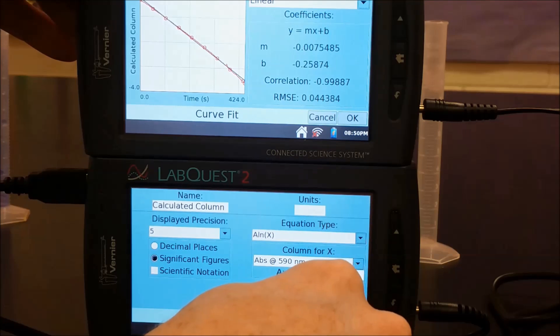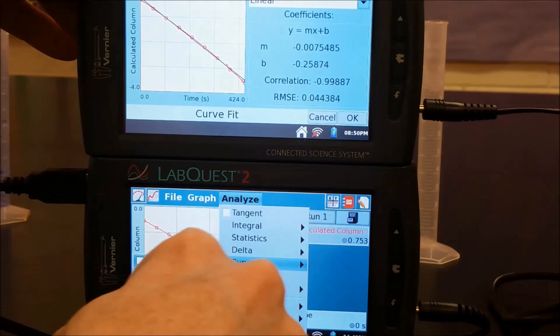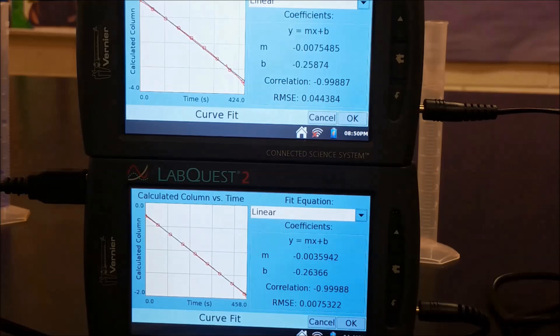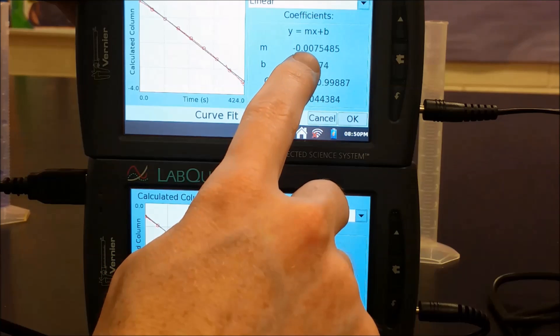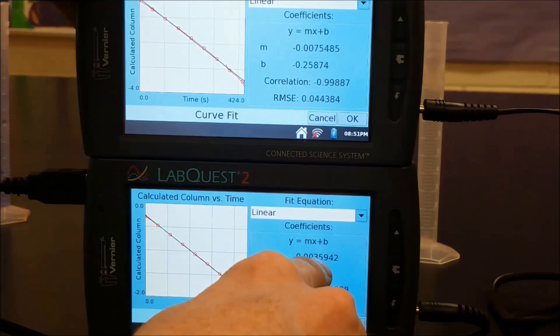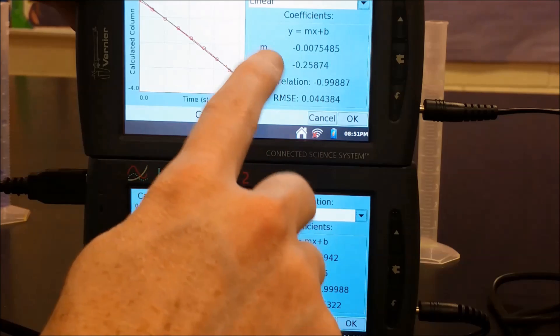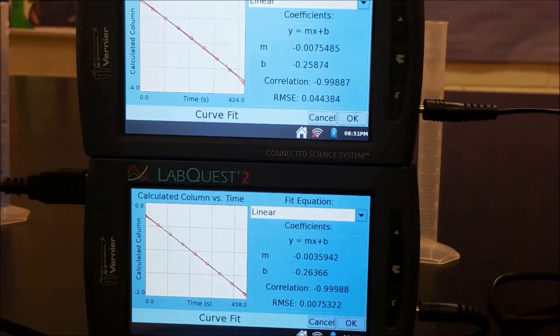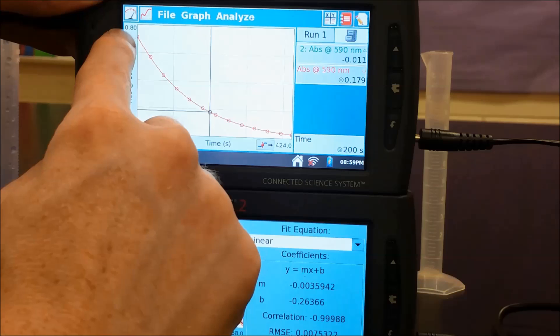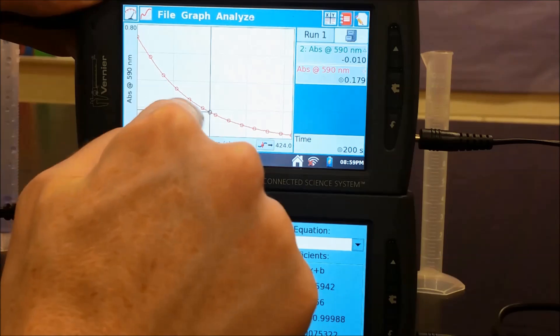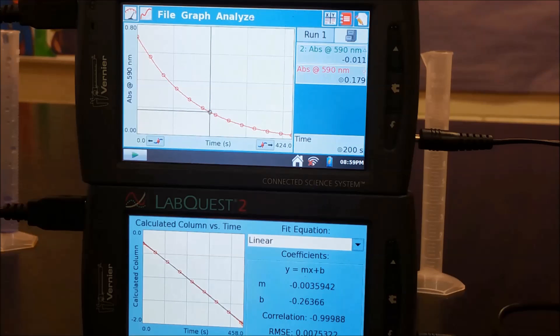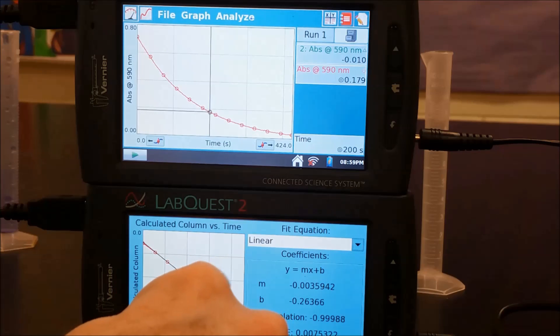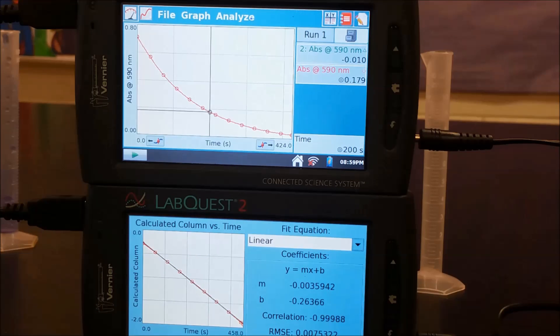So under natural log there. And we end up with a similar thing, and when we do the curve fit on this we're going to see that the slope has changed from the hydroxide concentration changing. So when we compare the slopes we have the two slopes here: we have negative 0.0075 and we have negative 0.0036. So if we look, we're seeing a ratio of two to one. So the double the hydroxide concentration ended up increasing our rate by a factor of two. So that would indicate that we have a first order relationship for crystal violet and a first order relationship for hydroxide. So what we could do is we could figure out what the slope is from that first or second point, and from that we could calculate a rate. We know the exponents of the concentration and we know the initial concentrations of everything, so we could solve for what the rate constant is. We can do the same thing on our other data as well, and what that allows us to do is then calculate what the rate constant is and then do the experiment again at different temperatures so that we can find the activation energy.